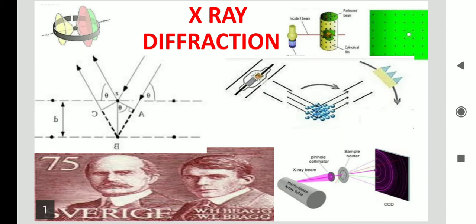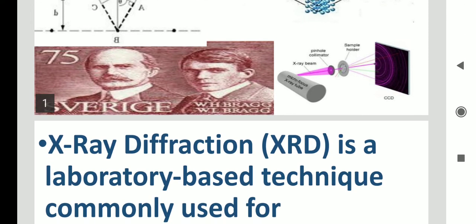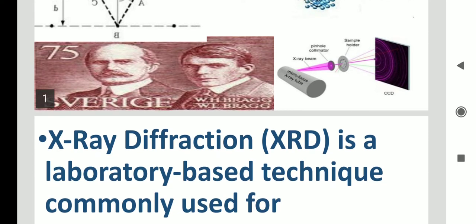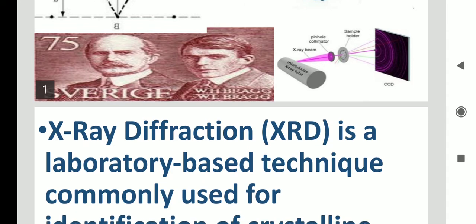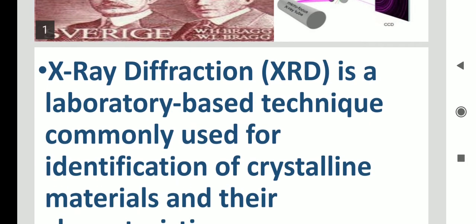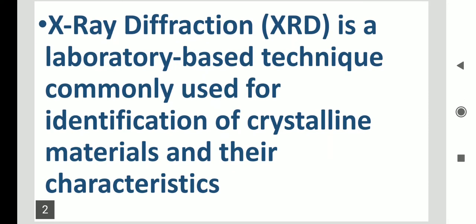Welcome to today's talk about X-ray diffraction. X-ray diffraction simply reads as XRD. X-ray diffraction is a laboratory-based technique commonly used for identification of crystalline materials and their characteristics.